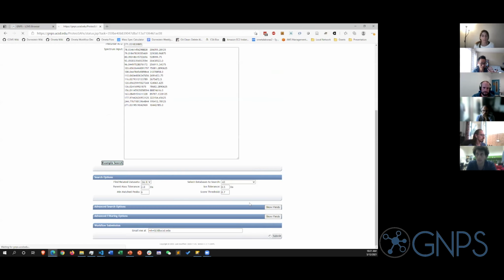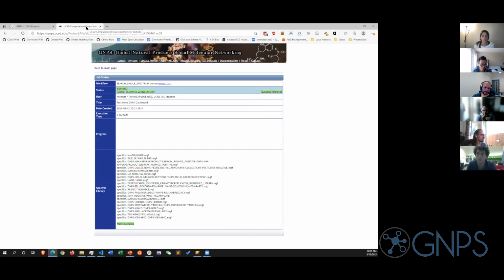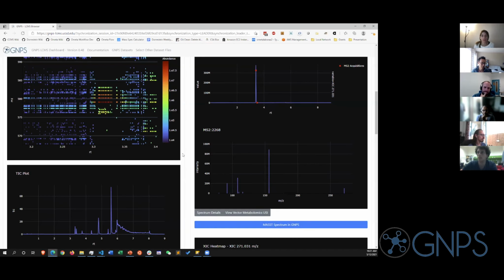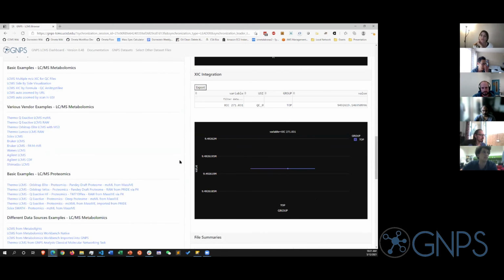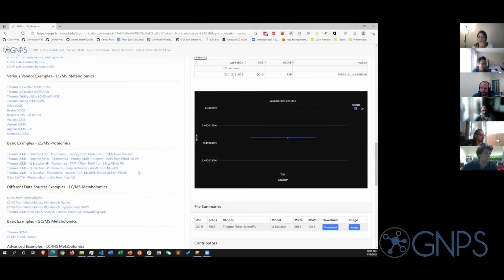And then minus that, you can quickly hit go. So that's kind of how a lot of these things nicely integrate into the rest of the ecosystem. And also, if you want to see examples, we try to list out all these different examples here, and they're simply URL links that you can click yourself for different ways to look at different types of data, different sample types, and different data sources. So that's kind of this big surface area we want to cover.